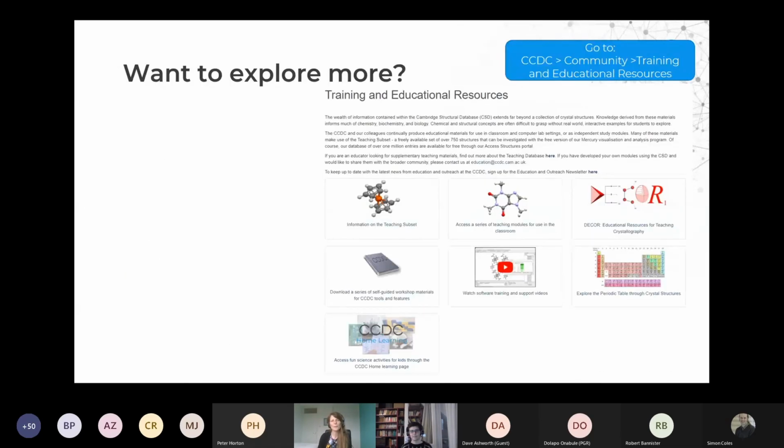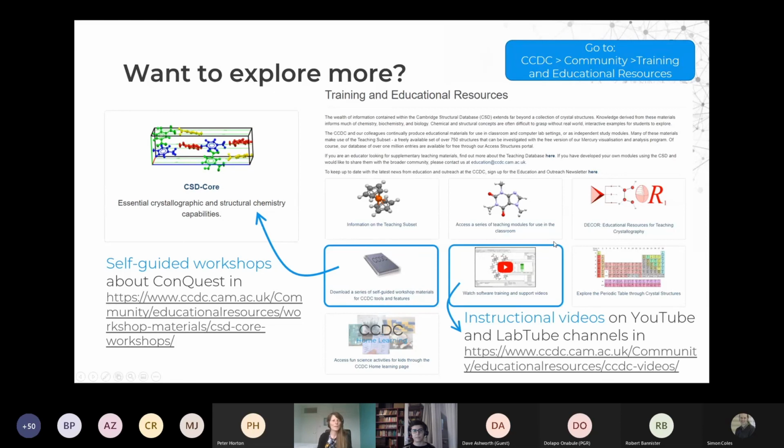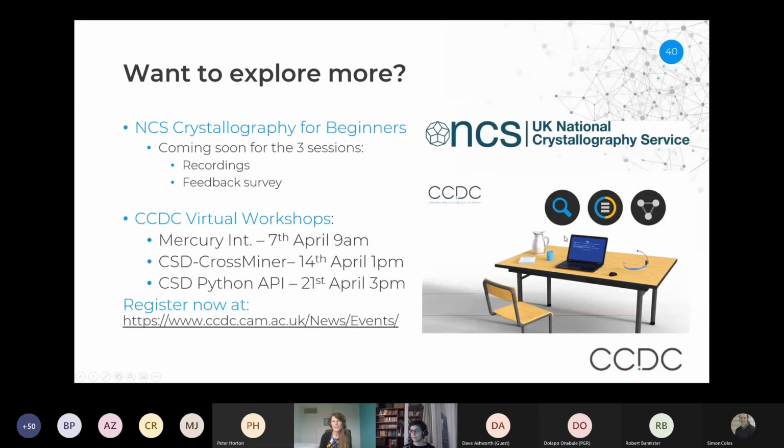If you did want to explore more, then we have got resources on our website. So you need to go to the CCDC website, community, and then training and educational resources. We've got self-guided workshops, so you could have a self-guided workshop on Conquest or some of our other tools using this link. And we've also got some instructional videos on YouTube and LabTube, and this would be the link that you'd need to go to. If you want to look back at what we've learnt in the last 3 sessions with the NCS, coming soon are the recordings of these sessions and a feedback survey.